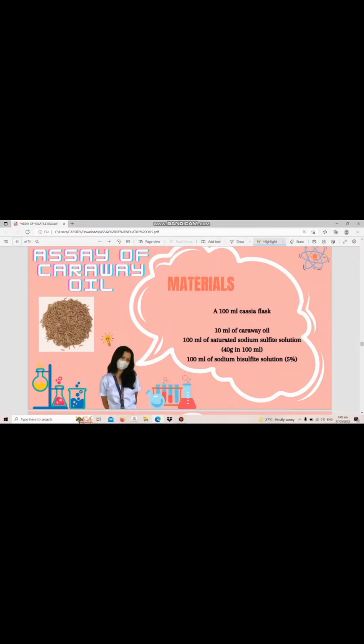Good morning, everyone. My name is Cassidy Magbanma, and for my assigned topic, it's exercise 14.5. Its object is the assay of caraway oil.